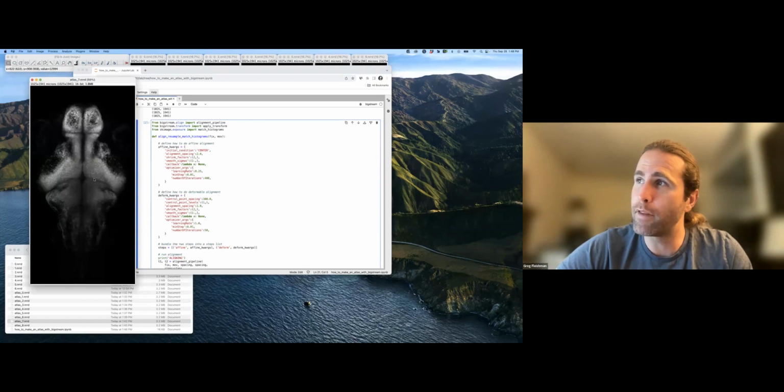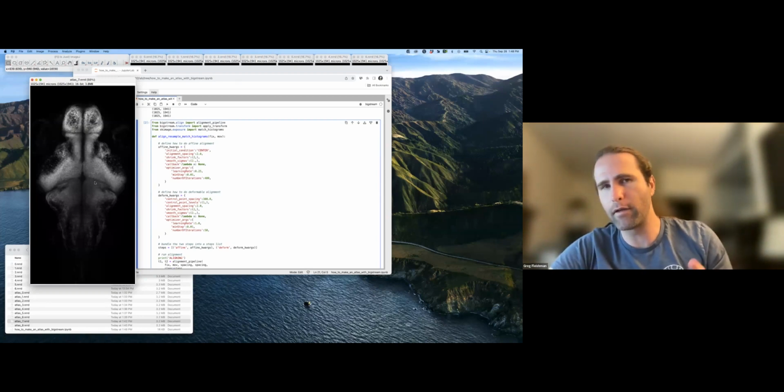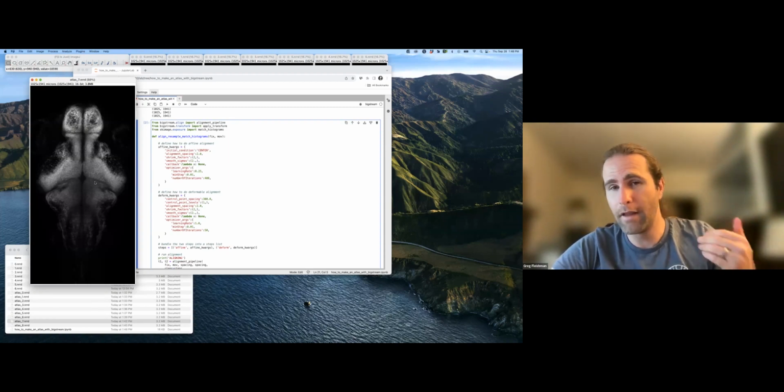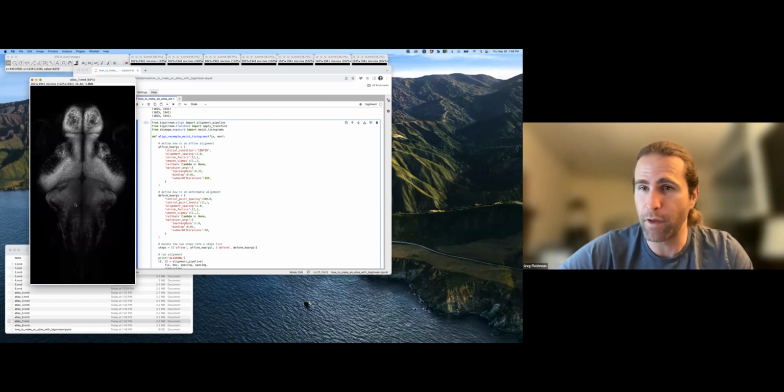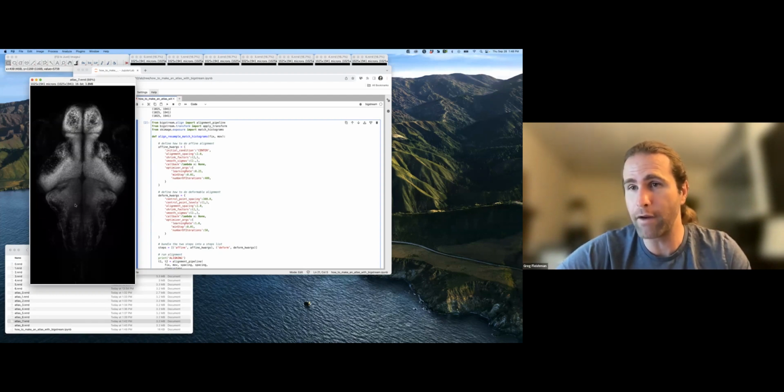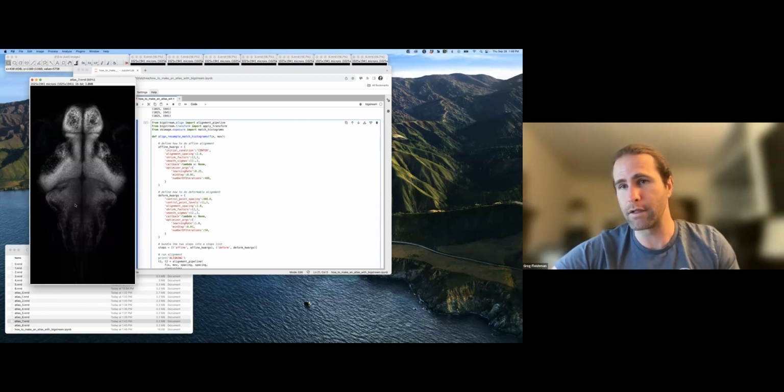And I think what you would end up with is an atlas where the edges are a little bit more crisp. Remember what I said before about how cells aren't always in the same place across different subjects. That's actually not always true. There are some cells that are close enough to each other that even across subjects, you could always register them together. There's 2 really big cells in the hindbrain of zebrafish. They're not present in this particular Z slice, but they're called the Mauthner cells, and they control the final decision about whether a fish is going to swim or not.